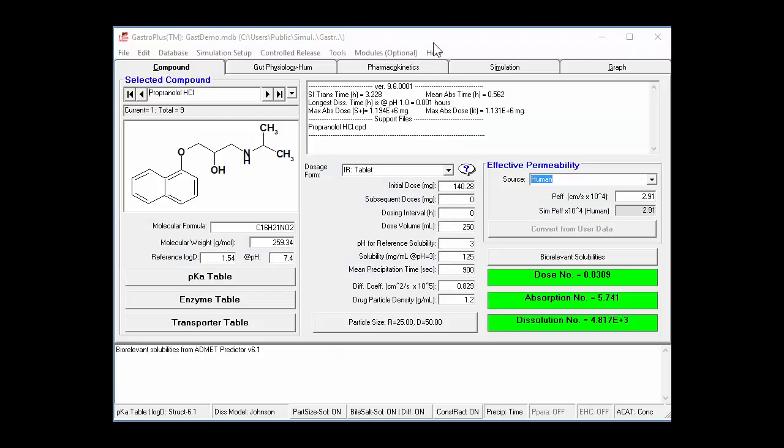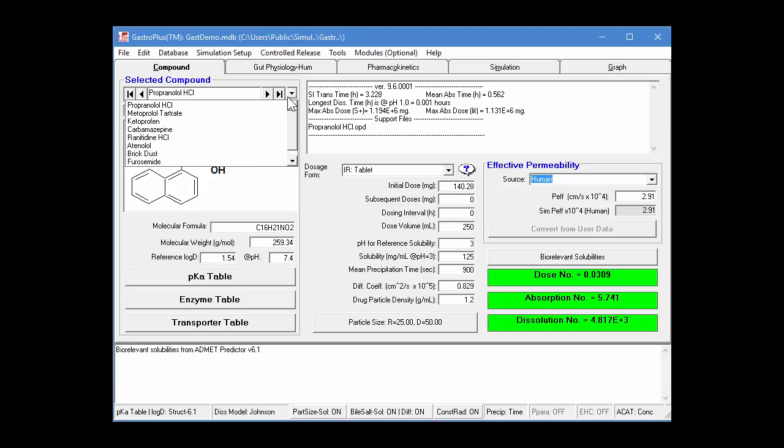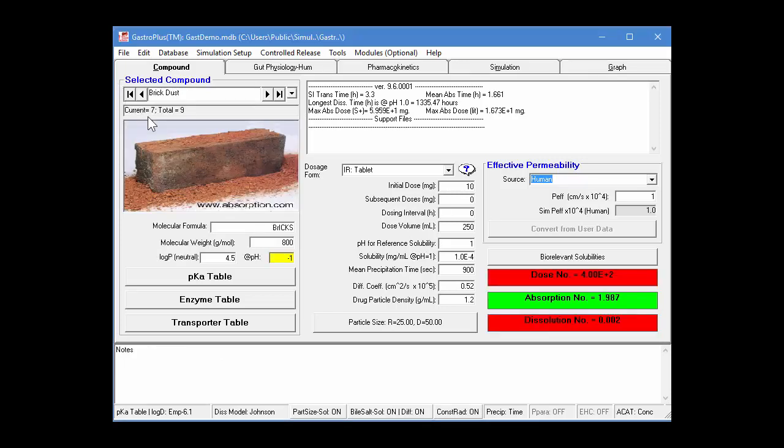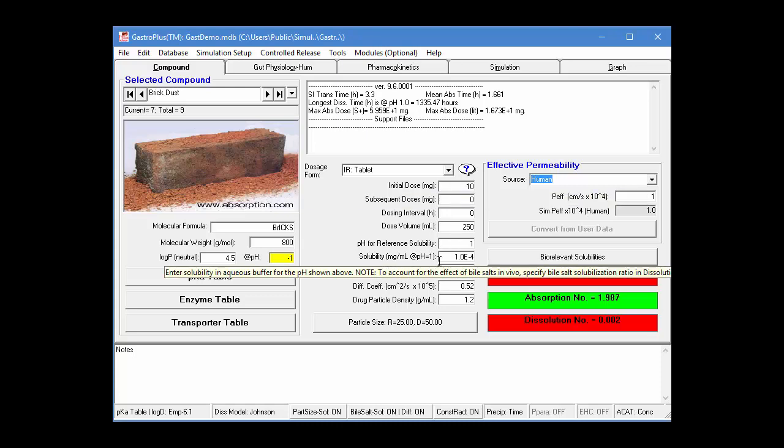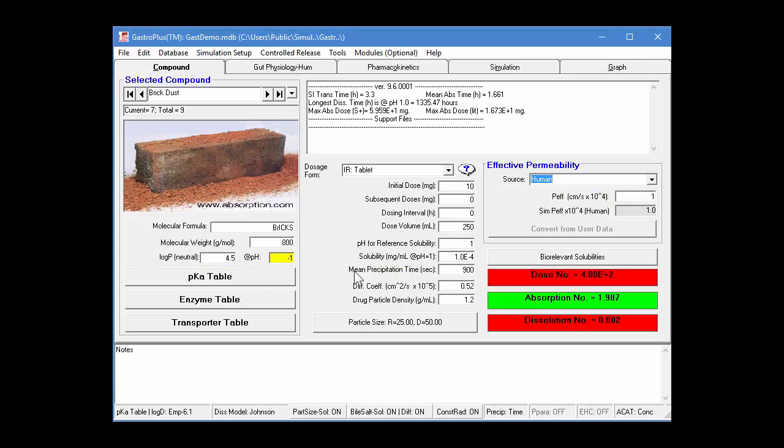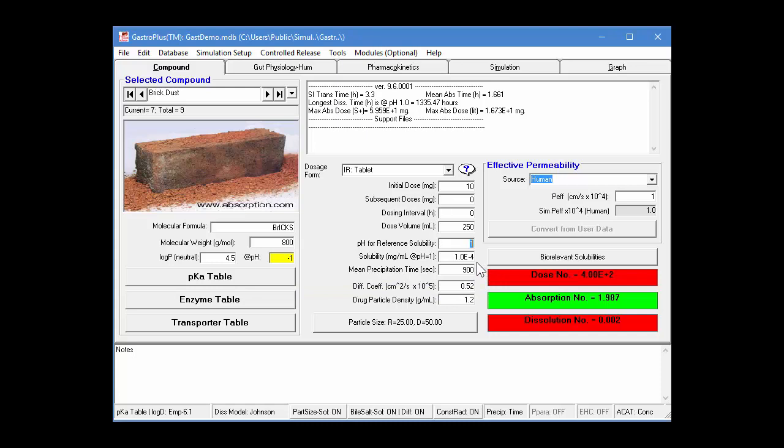Let's see what this looks like in GastroPlus. So I started GastroPlus, and we're just going to use the gas demo database. And I'm going to go to the brick dust record, which is the seventh record in this. And obviously this is just a made up example, but it's got a dose of 10 milligrams. It's got a very low solubility. The solubility is 1 times 10 to the minus 4 milligrams per milliliter. And at this particular dose, you see that your dose number is highlighted in red.